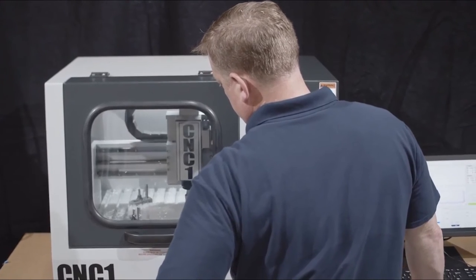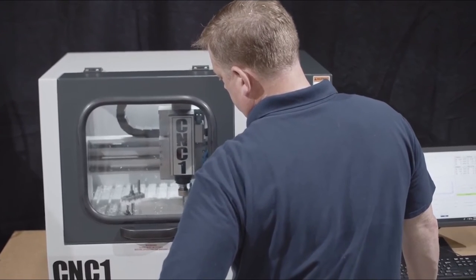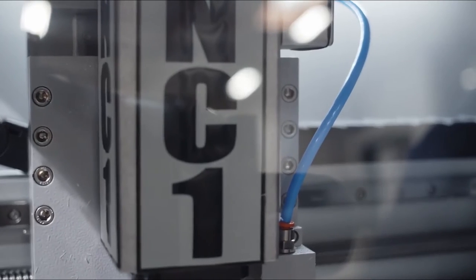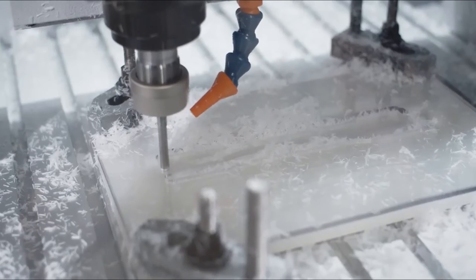Also available, the CNC2 features a larger footprint, bigger cutting back, and the ability to cut samples up to 100 millimeters thick.